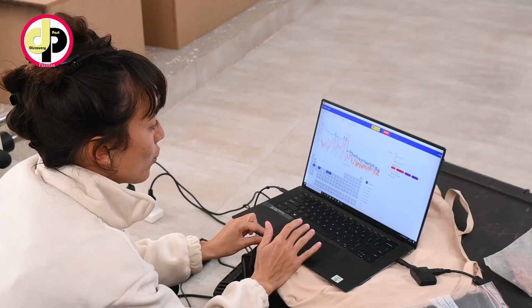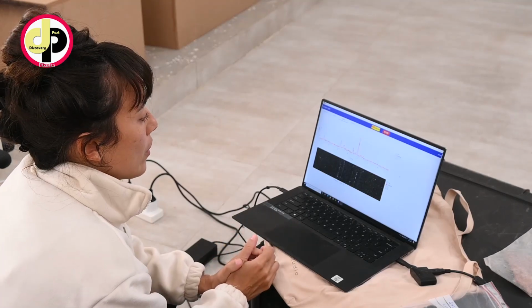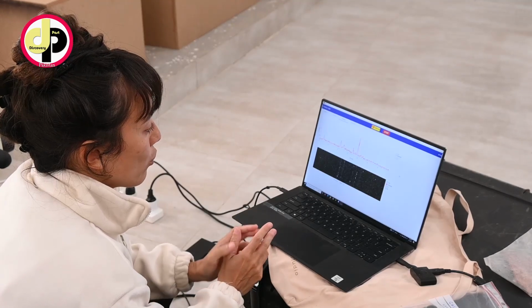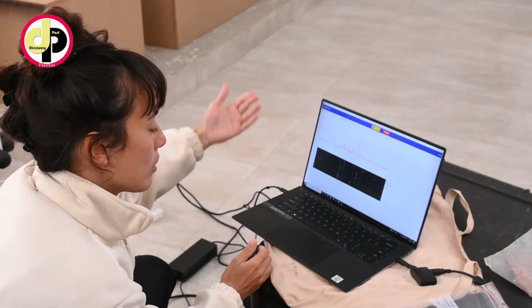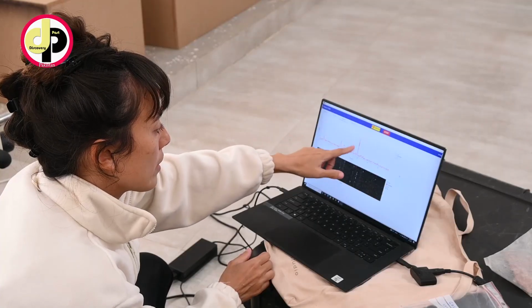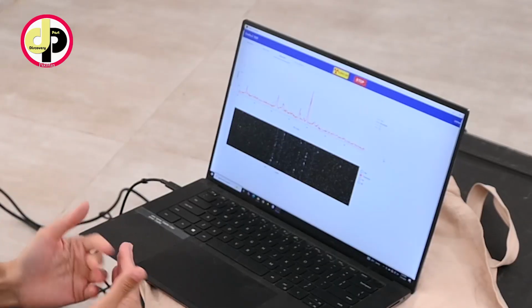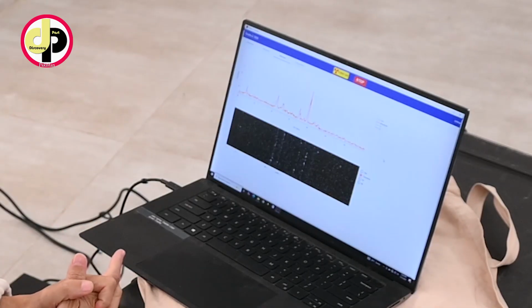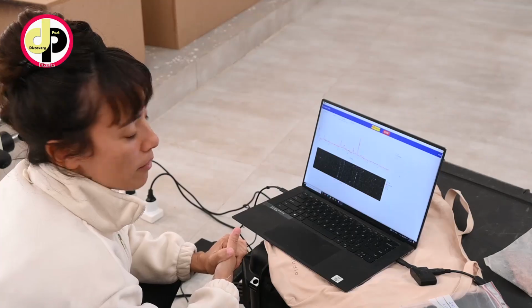And then for the X-ray diffraction, we have another kind of spectrum here. This is more regarding the crystalline structure of a molecule, but in that case we will need also to compare it with a database to understand the peaks, what kind of distance between the atoms it is linked to. And so like that we'll know the crystalline structure of the material.